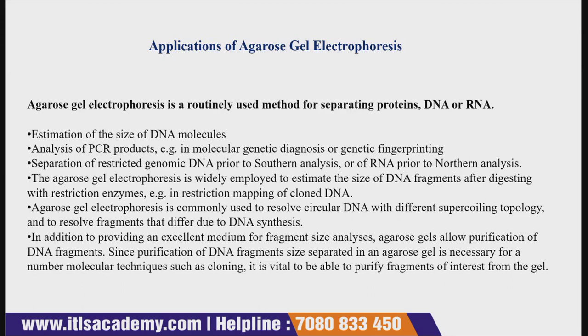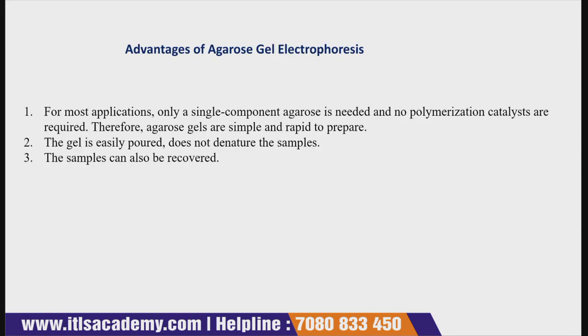So as the last point says, the purification of DNA fragments size separated in an agarose gel is necessary for a number of molecular techniques such as cloning. So it is also involved in cloning of DNA. It is vital to be able to purify the fragment of interest from the gel. So it has great advantages, or you can say applications, where the cloning of DNA takes place.